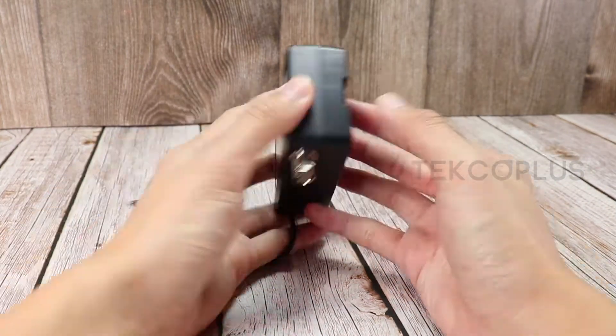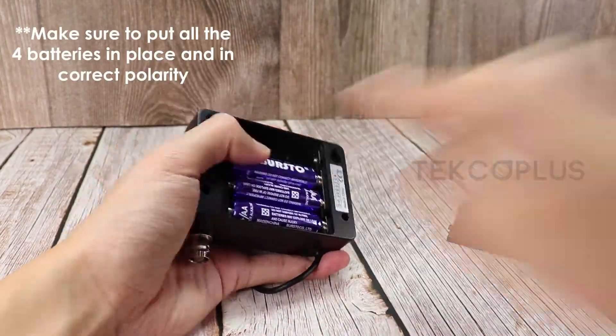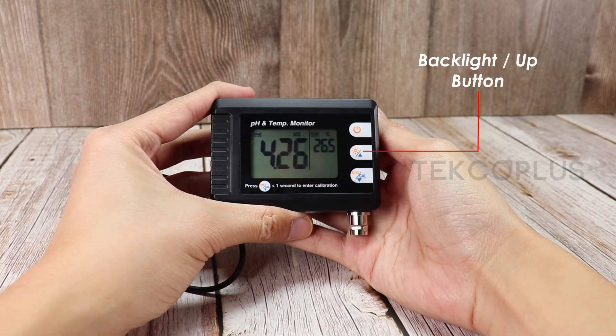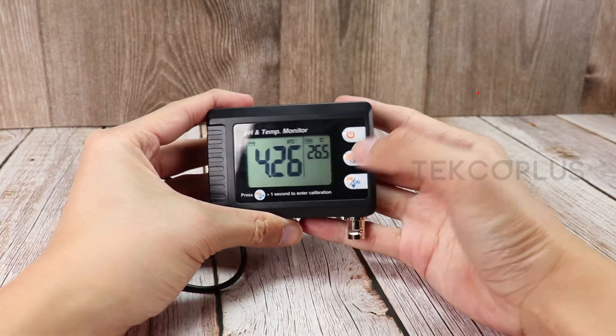To start, make sure to put all four batteries in place and in correct polarity. Know the function keys. Press the backlight up button to turn on or off the backlight function.